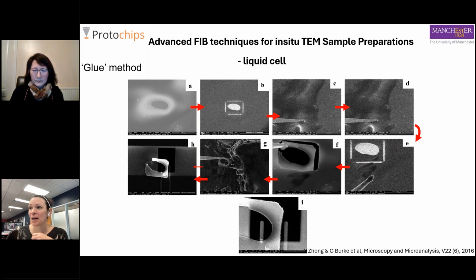Dr. Zhong, thank you for your helpful talk. I wanted to ask, which pattern should I use for welding without GIS: line, RCS, or CCS? Are there any differences?